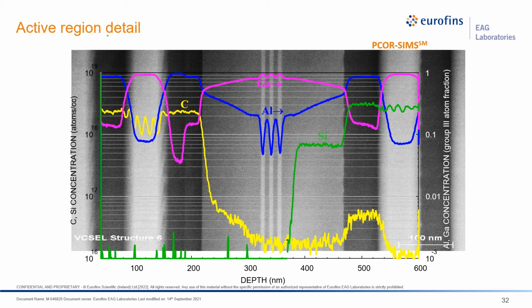We are actually looking for dopant diffusion into the quantum wells, and the dopant concentrations as the AlGaAs is varied. As we've been saying, P-core SIMS is needed if you want to measure a dopant concentration in a varying composition. And as you can see, you can do that very clearly in this analysis. We are resolving the quantum wells in this mode, but SIMS is never as good as a high-resolution TEM EDX analysis to truly measure the peak concentrations of these quantum wells and do a study of it.